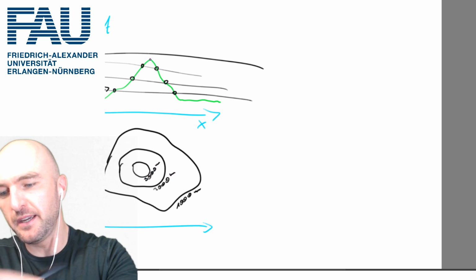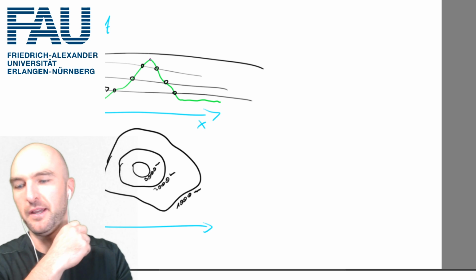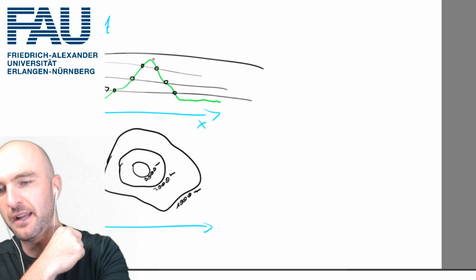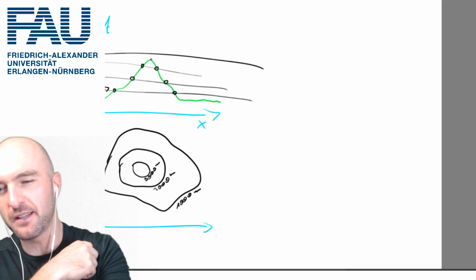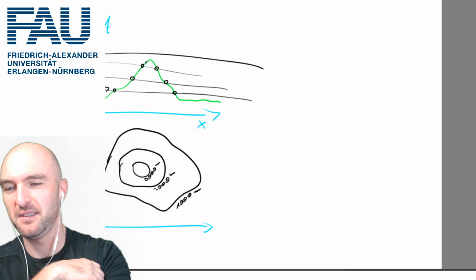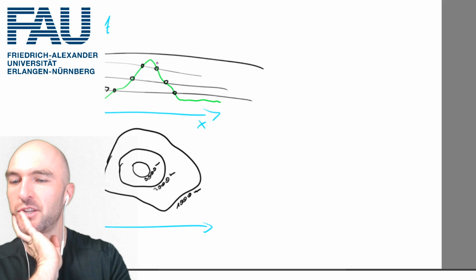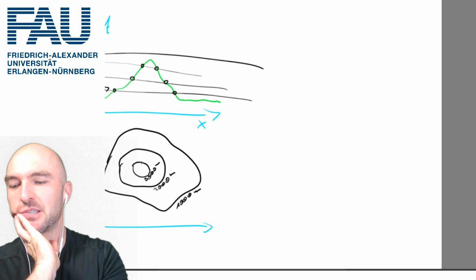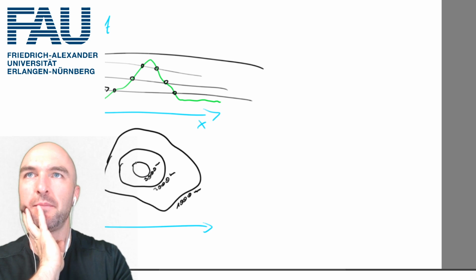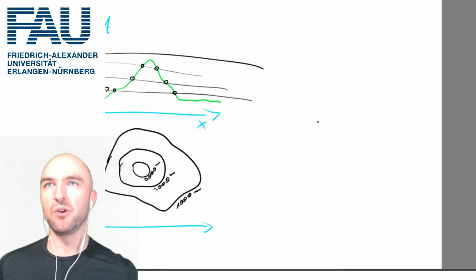And what you can see is that it's not possible for you just by the lines to see where the top is, because we have no line at 3,495 meters. That's what the top here is. And this is essentially what an iso line is. Yeah? So this is an iso line. And we do the same thing in 3 dimensions, okay? So we create an isosurface.